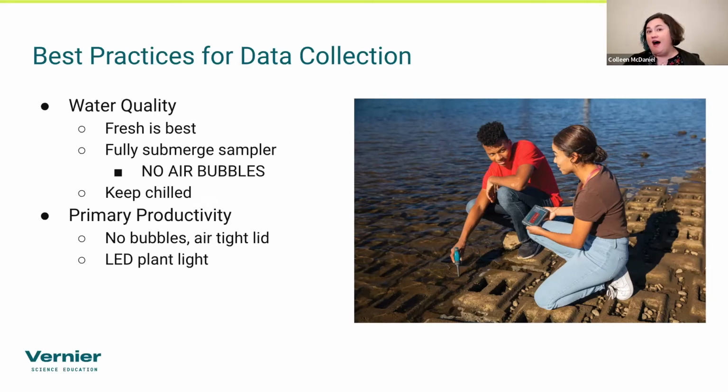Honestly, tap is going to be fine. Distilled water is great if you have it. If you don't, I've personally used tap water and have not had a problem with it before. I'm also a true biologist, not a true diehard chemist, so chemistry people might think otherwise, but if we're just measuring temperature and oxygen, tap is fine.